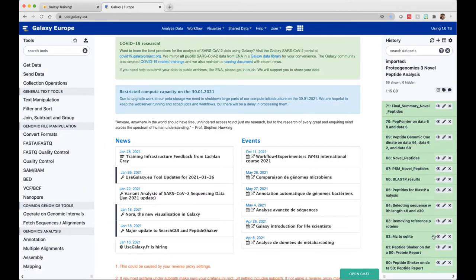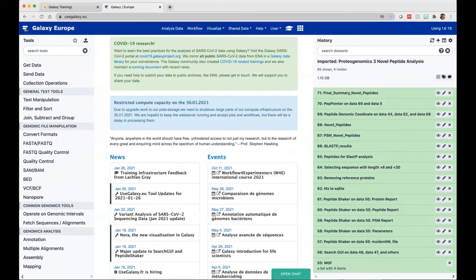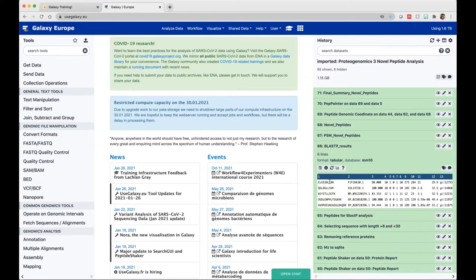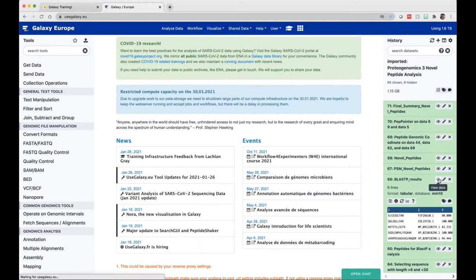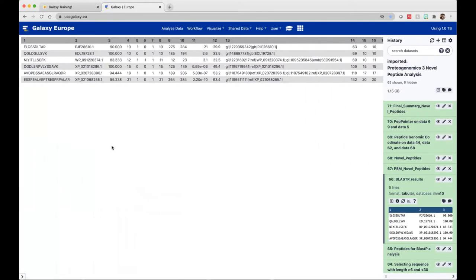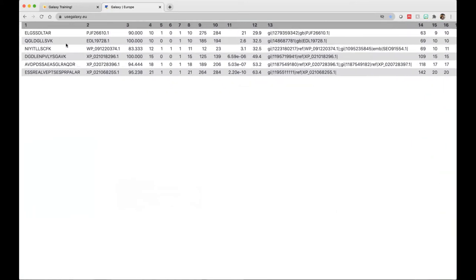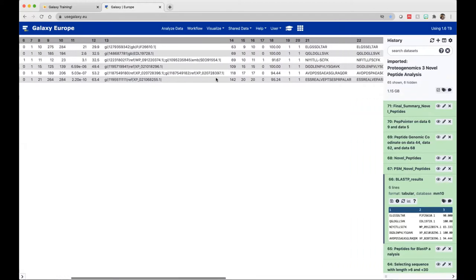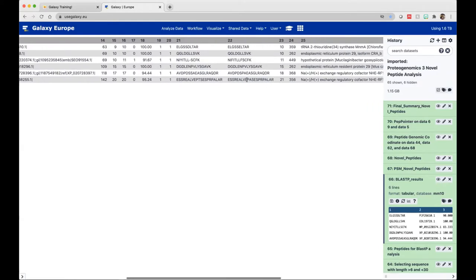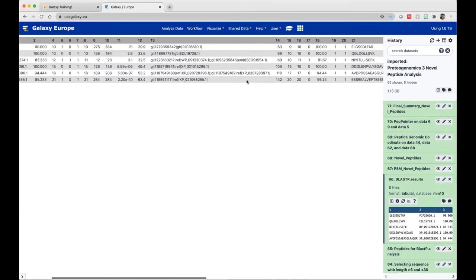All tools have completed running in the imported history. The last part of workflow two ended at peptides for BLAST-P analysis. These are the tools present in the current workflow, part three. The first step is that we performed NCBI BLAST-P analysis and have results for the six peptides. If I click on the eye icon, I can view the results. It shows the peptides, the proteins, the identity information, and all 25 columns that BLAST-P provides.